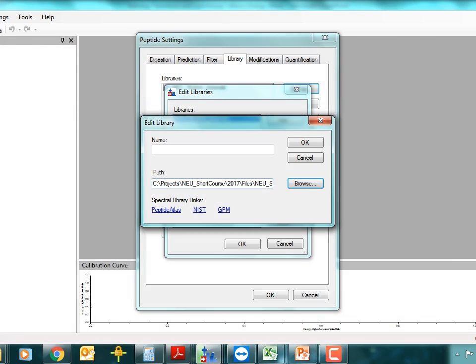Okay. So for me, I don't know if this is something that I'm just doing incorrectly, but Skyline doesn't copy the name into the name part. It doesn't automatically update it. So I'm going to put the name of my library. I'm just copying and pasting the name. I'm removing the blib extension because I think it might add another one to it, but you should have something like this. This initial file, this path will be different for yours, but you want to have a directory to where that blib file exists in your documents folder, and you want to have the name of your library.